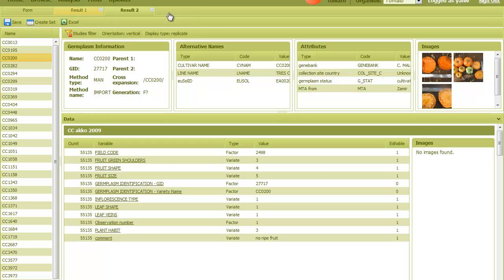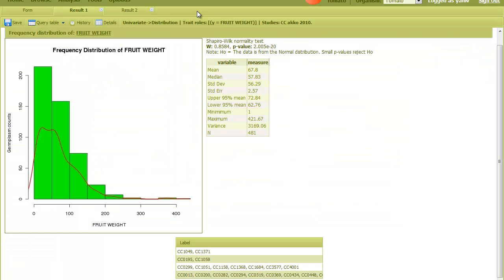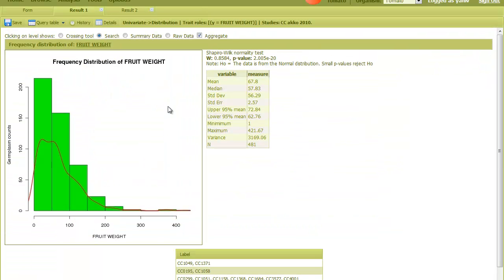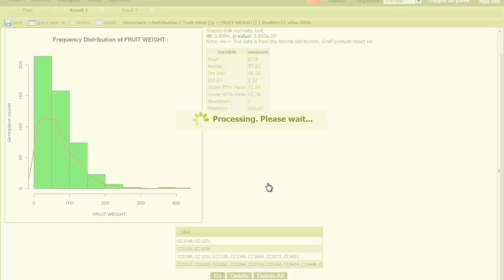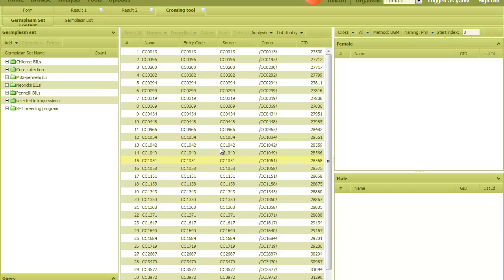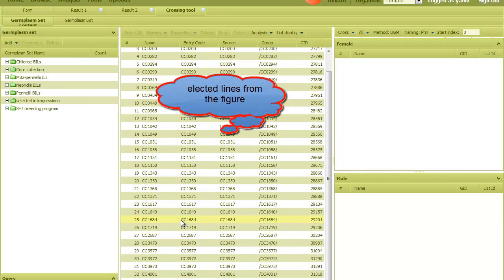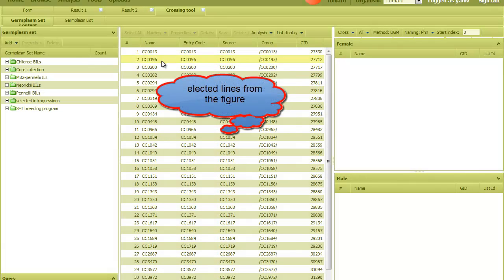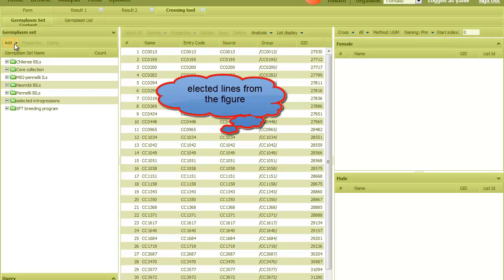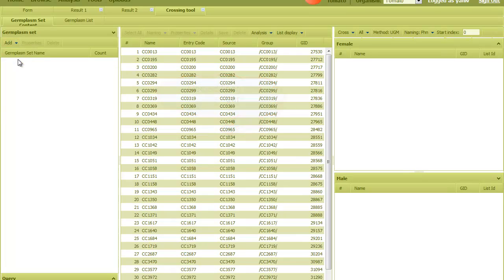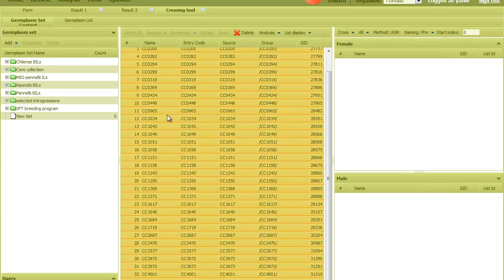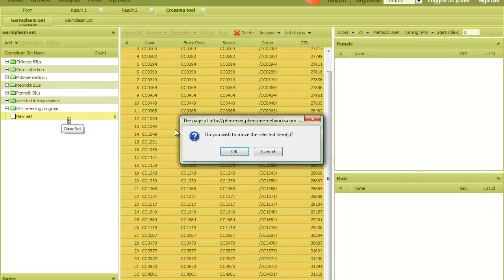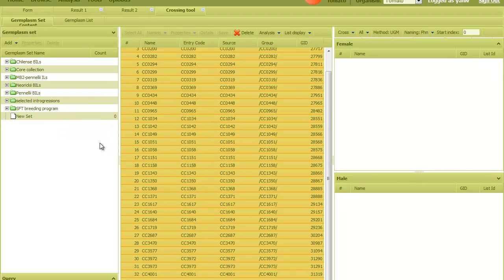Going back to the figure, I can select this checkbox and now move the lines into a list. The selected lines are displayed over here. I can create a new list and drag these lines into it. The list can have a name.